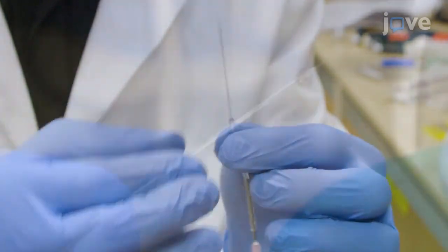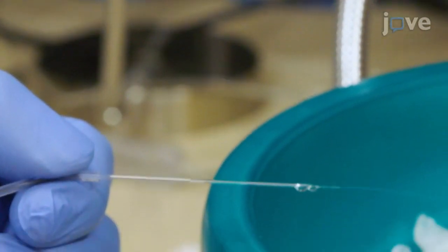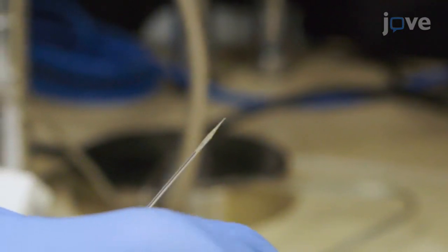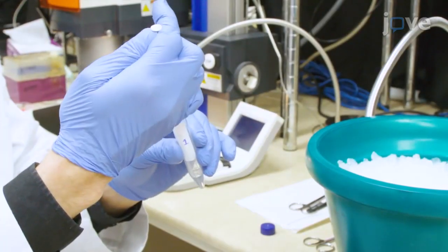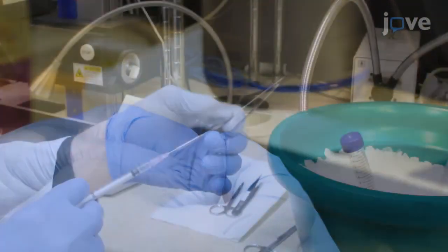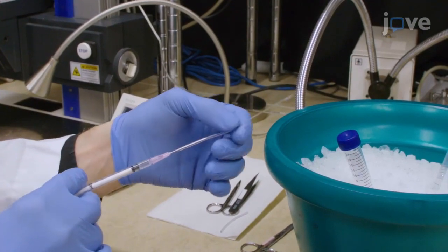Inspect the needle for cell clogging and air bubbles. If cell clogging is observed within the capillary, remove the capillary, re-suspend the cells, and replace it with a new capillary. Use the plunger to push out any bubbles.